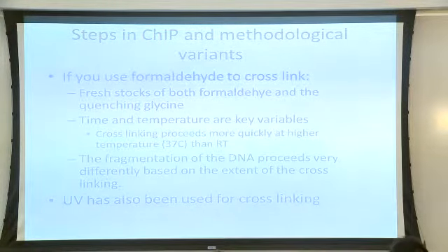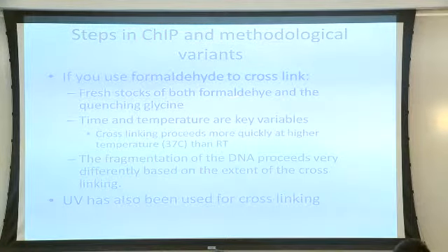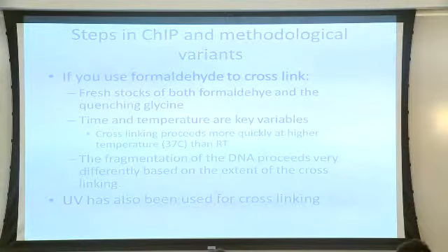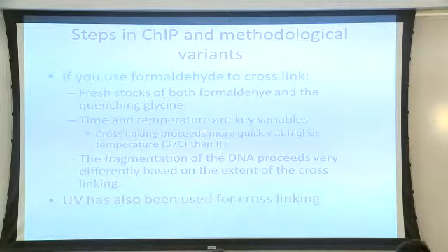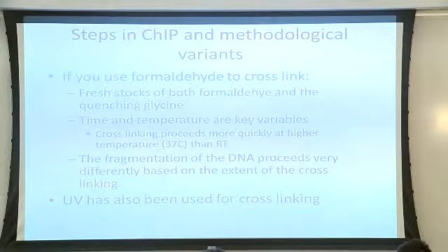Now, if you do use formaldehyde to cross-link, one of the things we've learned is it's important to use very fresh stocks of both the formaldehyde and the glycine that we use to quench the formaldehyde. Time and temperature are key variables. Cross-linking proceeds more quickly at higher temperature than it does at room temperature, but it may be possible to achieve equivalent cross-linking with longer times at room temperature, which is just a practical consideration if you have a way to do cross-linking in a fume hood with heating or not.